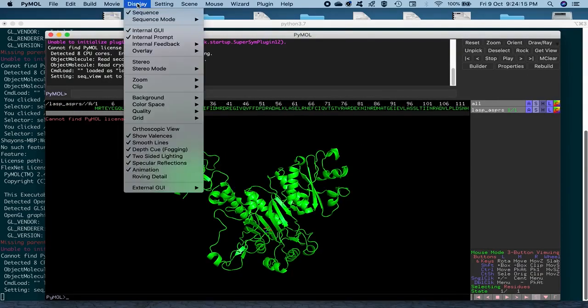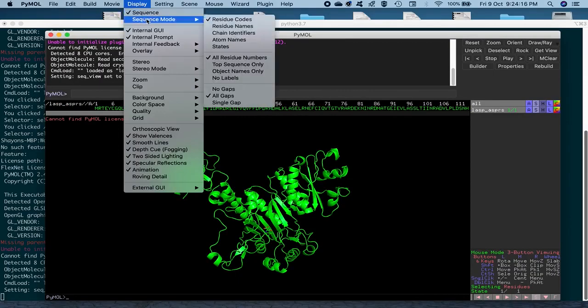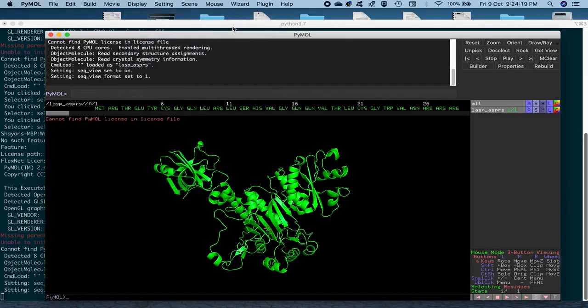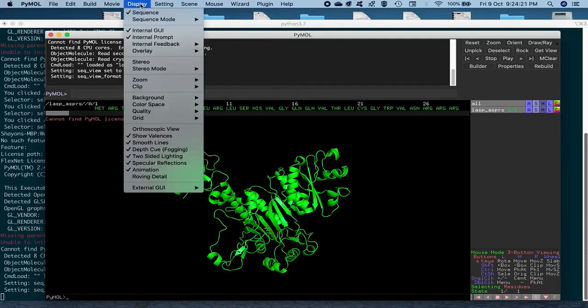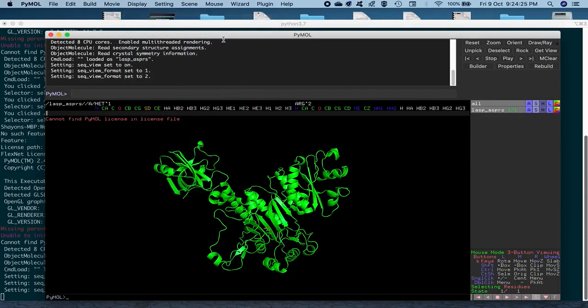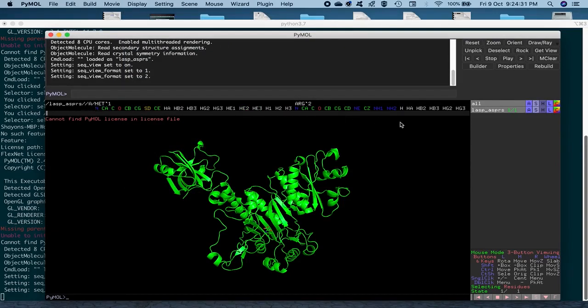So, and also change the sequence mode to, let's say, residue names like the three letter codes of this residue. Or you could also display the atom names. Okay, so you see the chain identifier here, that's A for all of it, including the ligand.